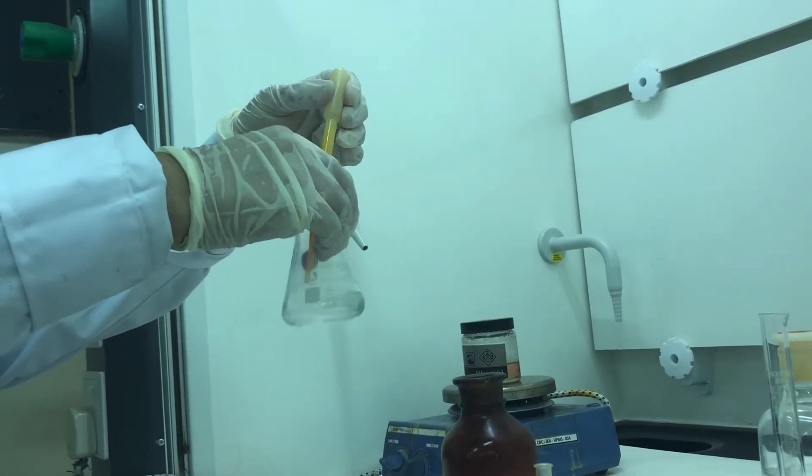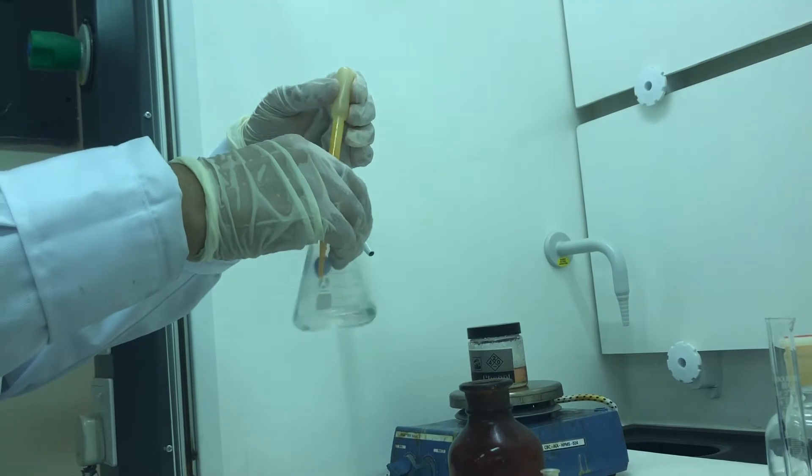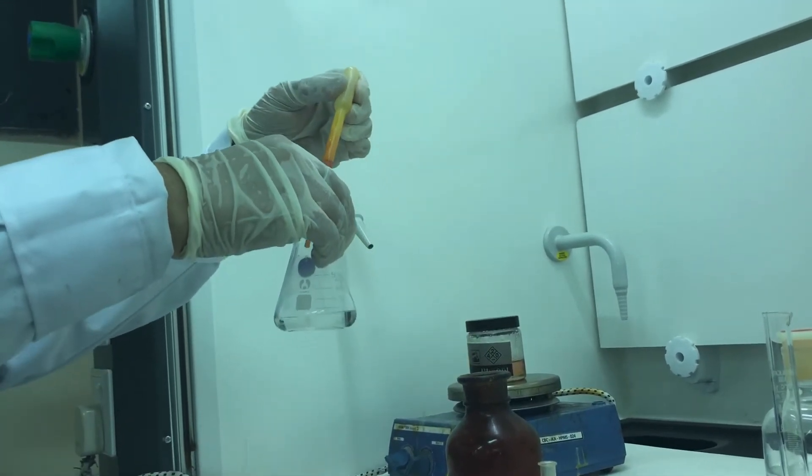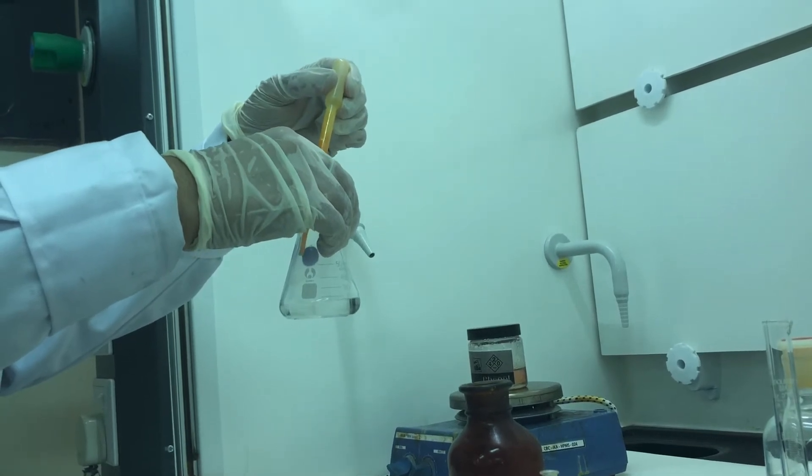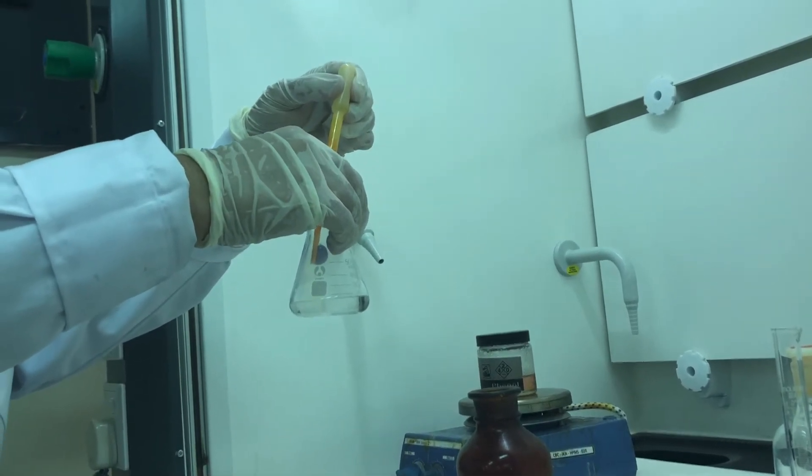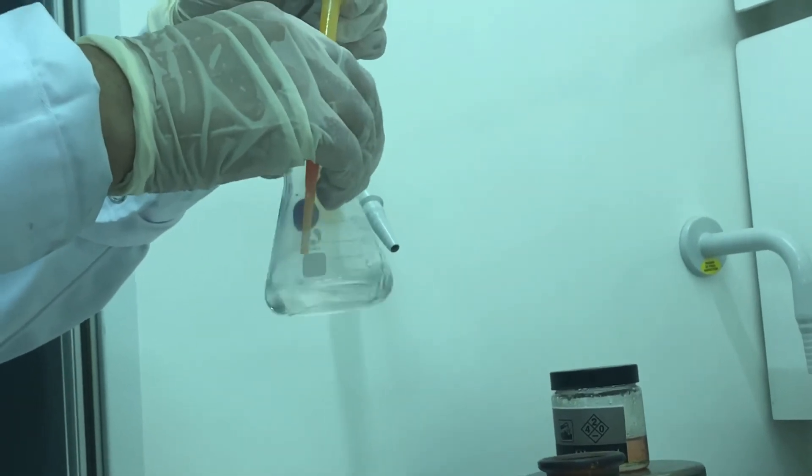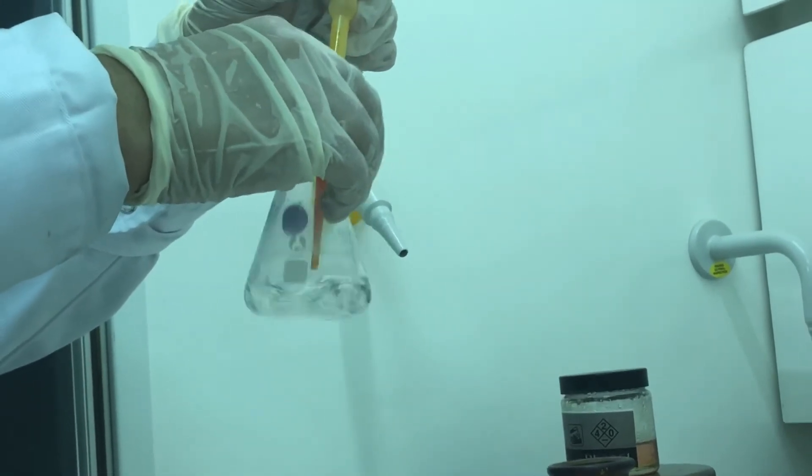So you can see the white solid is formed. But still, we need more excess of bromine to form the product.